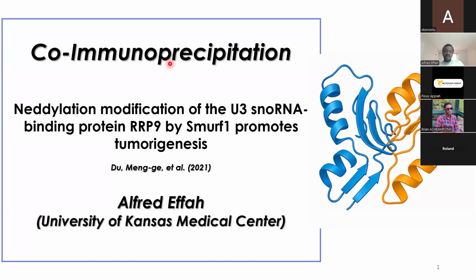I will be talking about co-immunoprecipitation, what co-immunoprecipitation is, what we use it for, and how we are going to use it to answer a particular research question. I'll be using this paper as an example, a paper that was published in 2021. It uses co-immunoprecipitation a lot. In all of their figures, you could see that there are a lot of co-immunoprecipitation techniques. So without wasting much time, I think we can begin.